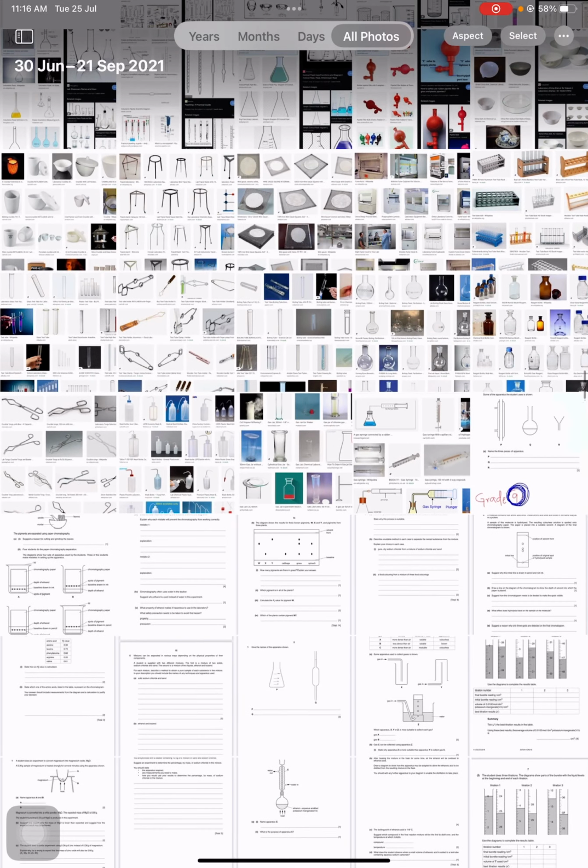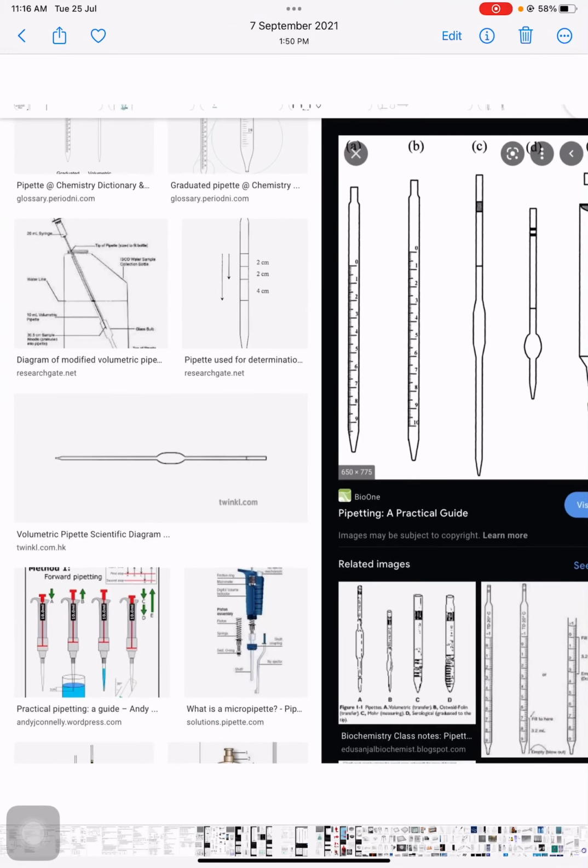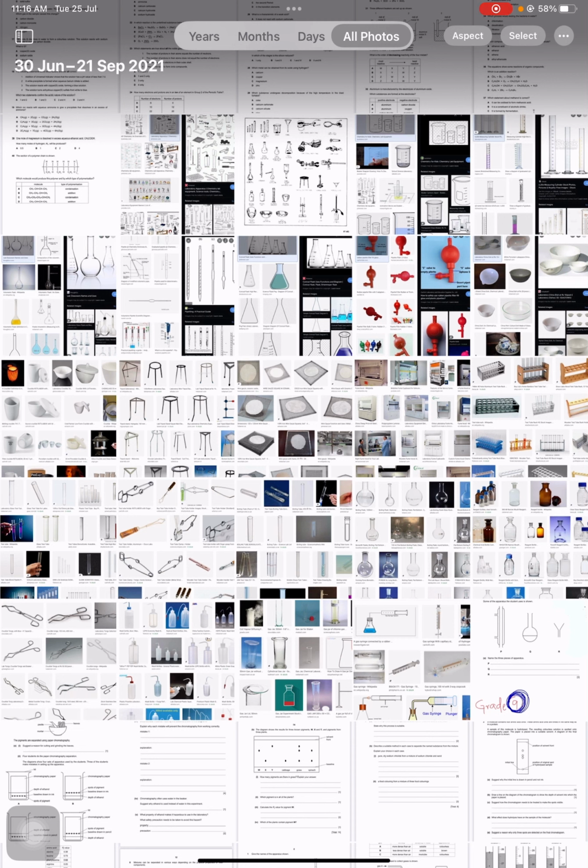Okay, this is the detail related to the apparatus. I would like to show you one more thing, and that is called a burette. A burette is basically an apparatus which is used in titration. Here I am going to show you the burette. In this diagram, this is the pipette only. There is no burette over there. I will show you a burette.